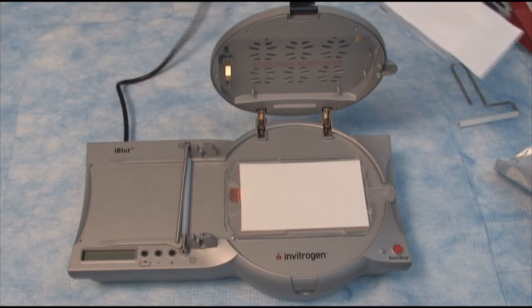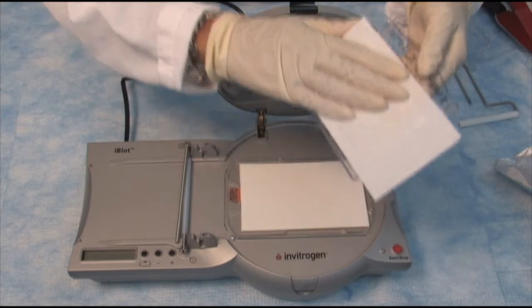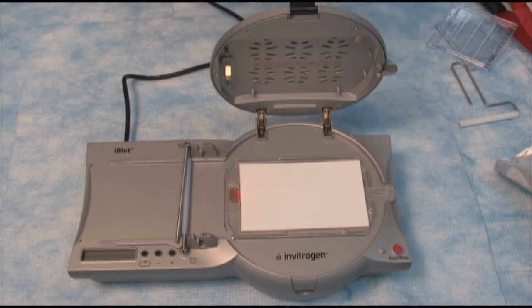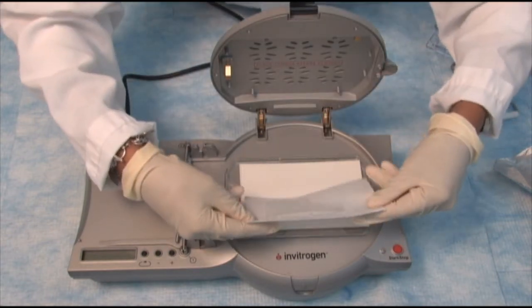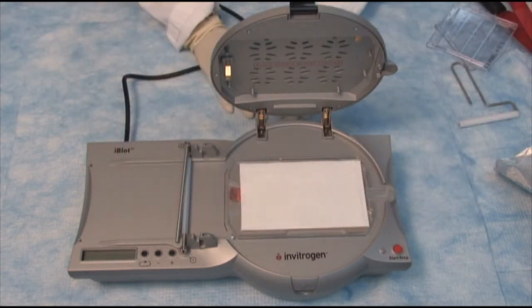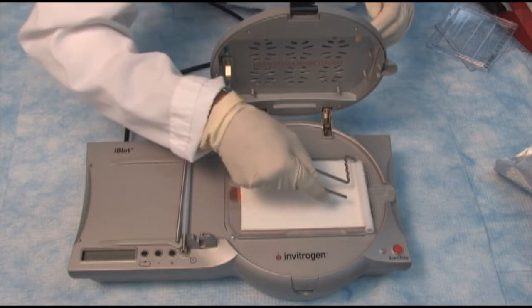Then we take a pre-wet filter paper and the gel that we ran earlier. I place the filter paper with the gel directly on the stack with the gel touching the membrane. Remove any air bubbles with the roller.